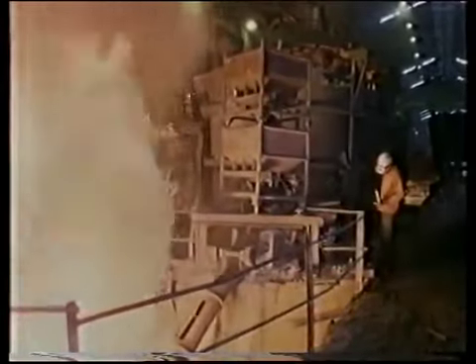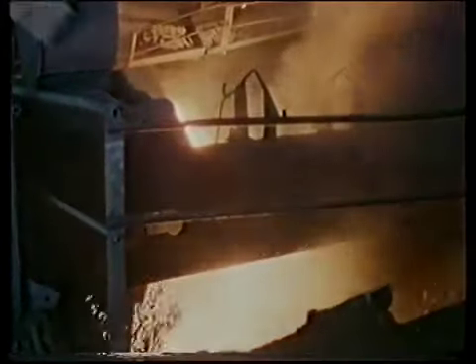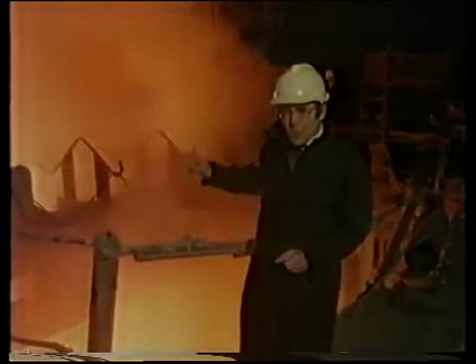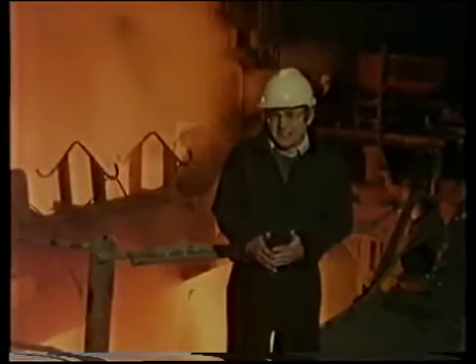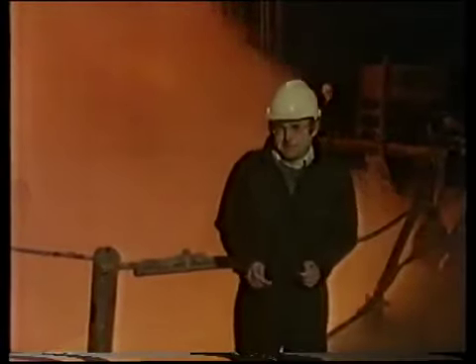And the composition of the steel should be right. In another 3 hours, they'll have another furnace ready to pour. And in a few weeks' time, this stuff will be rolling round as motor cars. And they've been able to find out in just 5 minutes what the composition of that steel is. And that's all been done with atomic spectroscopy.